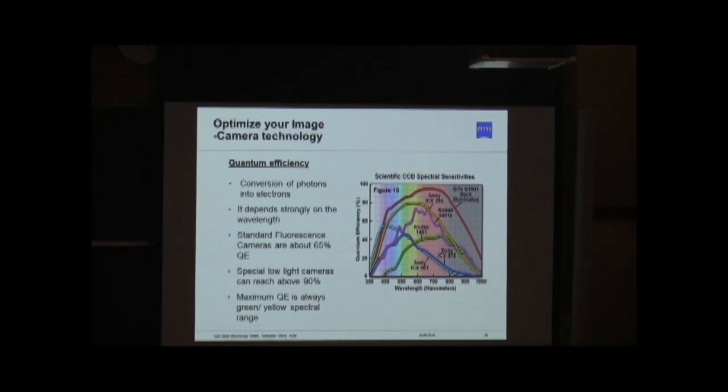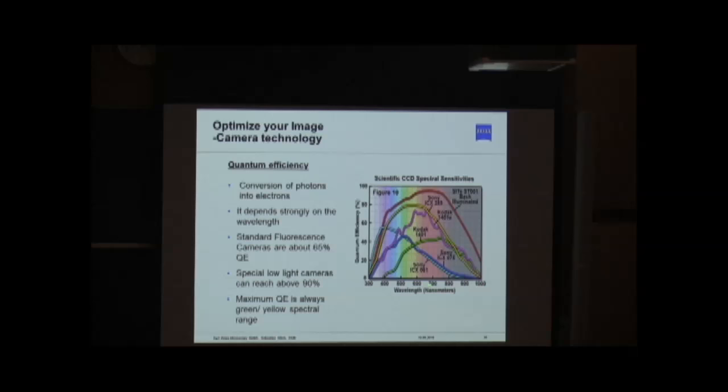What you have to know, and I've already told you that the working principle is wavelength dependent, is that depending on the camera that you use, you have different kinds of camera chips. And most of the chips that we actually have in microscopy, on different microscope systems, independent of the producer of the camera or of the microscope system, actually derive from these big companies that mainly produce these kinds of chips for smartphones. Right? So it's not a real business for these big companies like Sony or Samsung or Kodak to produce camera chips only for microscope cameras, because the number of cameras for microscope systems is too small. So microscope companies look at these parameters, and they ask Sony, the sector of Kodak, to deliver some of these chips, and we can improve them.